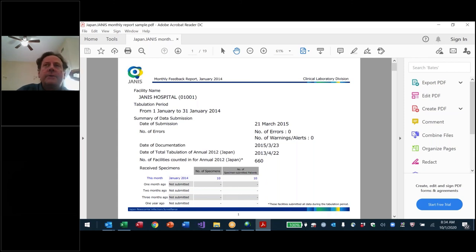Well, they did it. I don't know if it's used in Ethiopia. There's a very widely used public health reporting platform called DHIS2. Most of the Fleming Fund countries use DHIS2. I don't know about Ethiopia. Are you familiar with DHIS2 in Ethiopia? Yes, they should be. Yes, they do use DHIS2. Maybe not the lab, but the MOA.